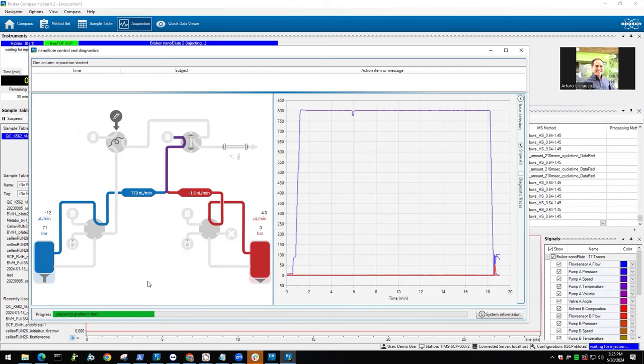We have processing servers where we run our samples on. So I don't know how they handle it here, what they do. But back in Bremen, we copy it to workstations and do the processing there. And we have automated scripts that can do the transfer. As soon as the acquisition is done, it starts the processing to push it onto a network drive or whatever location you specify.